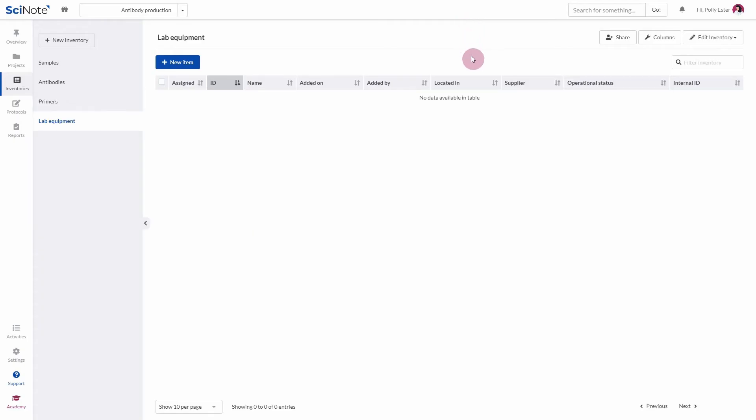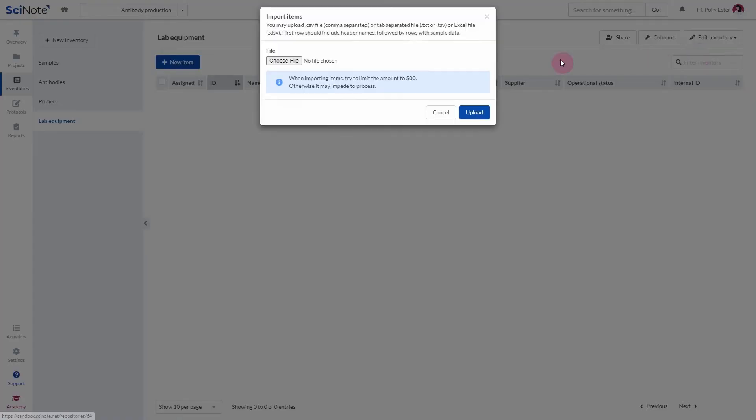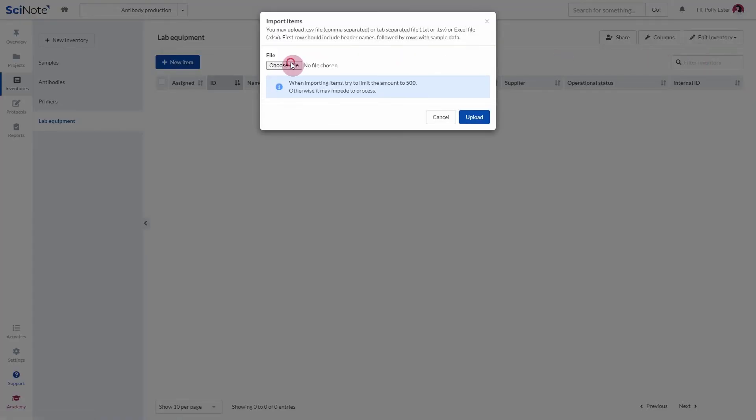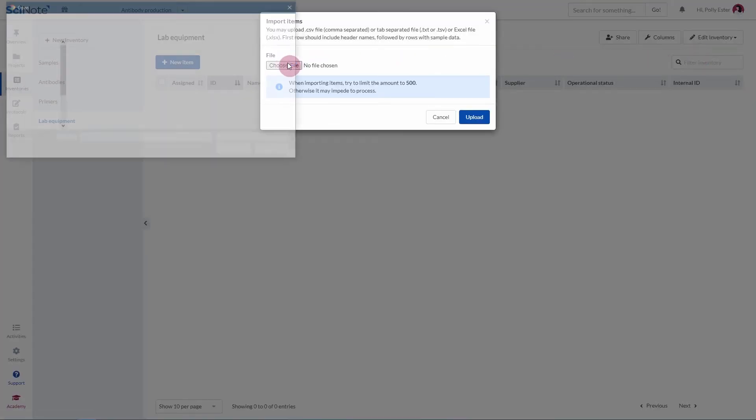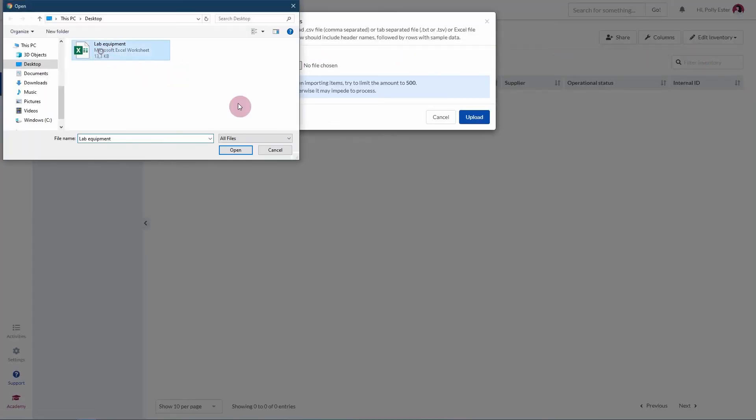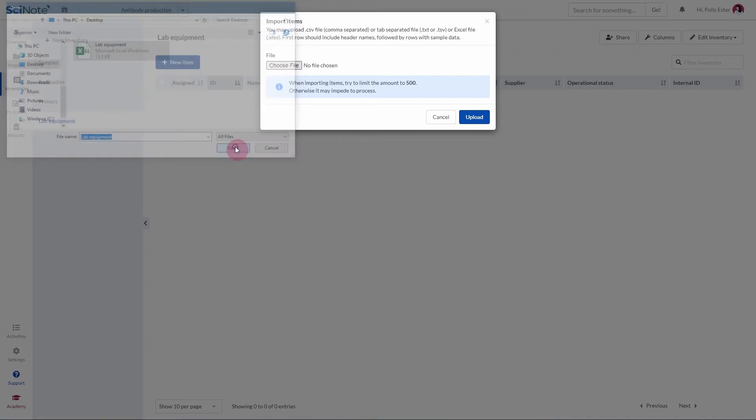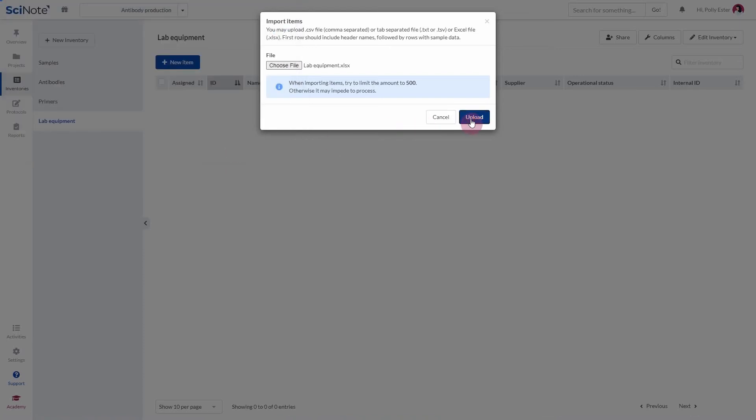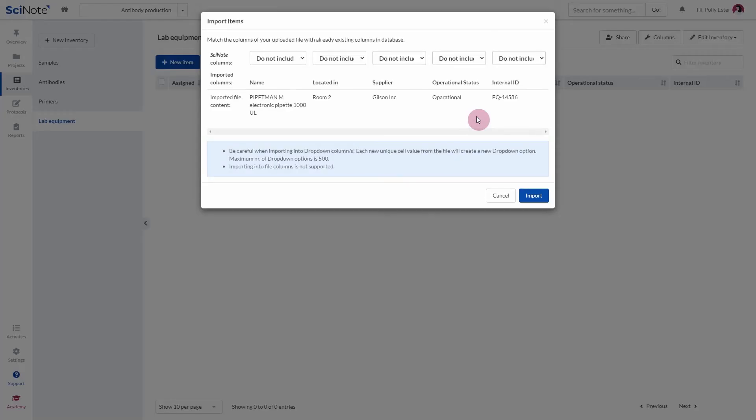Once you have the necessary columns created, click on Edit Inventory and then Import Items. Click on Choose File and select an Excel file from your computer, then click Upload.